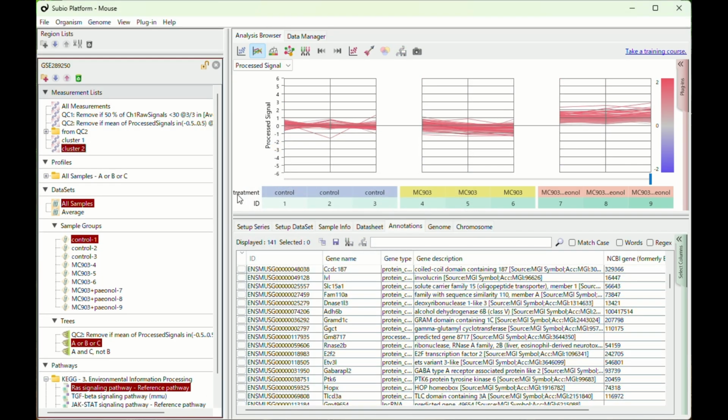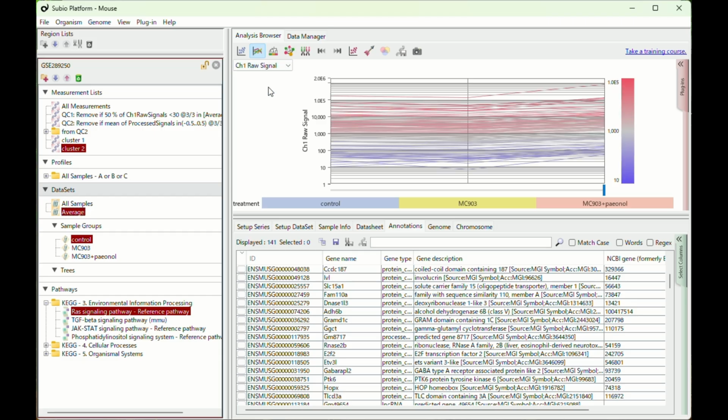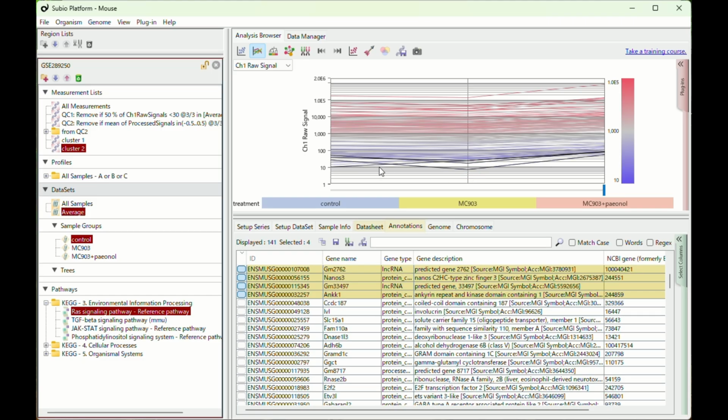Of course, you can separate these genes by expression level and extract on/off behavior candidates, as in the previous example.